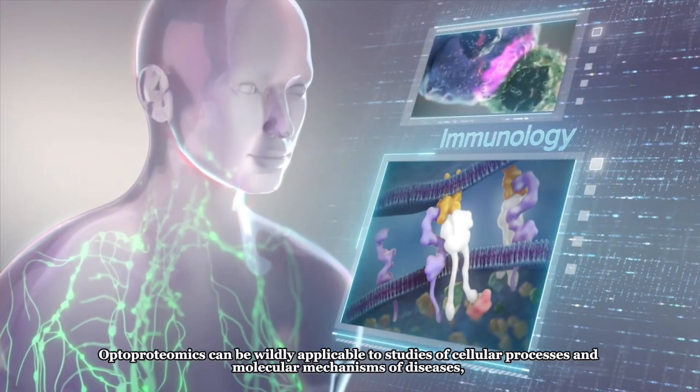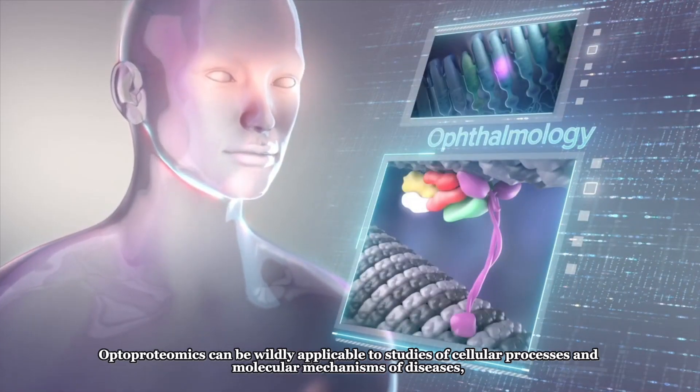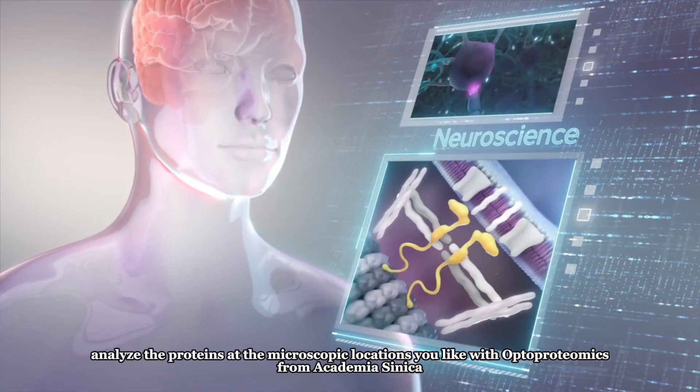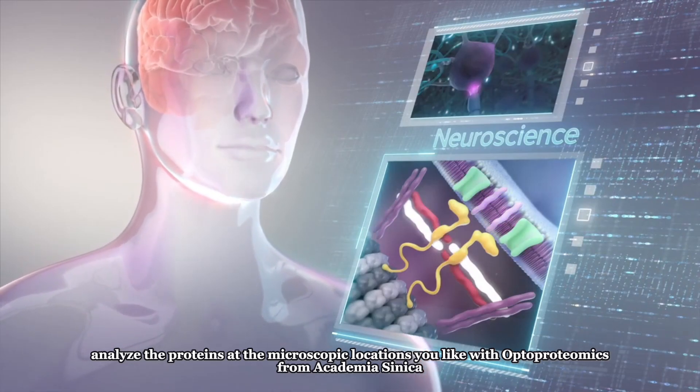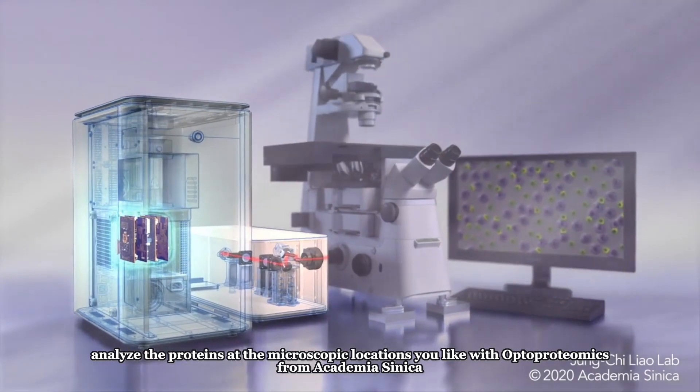Optoproteomics can be widely applicable to studies of cellular processes and molecular mechanisms of diseases. Analyze the proteins at the microscopic locations you like with Optoproteomics from Academia Sinica.